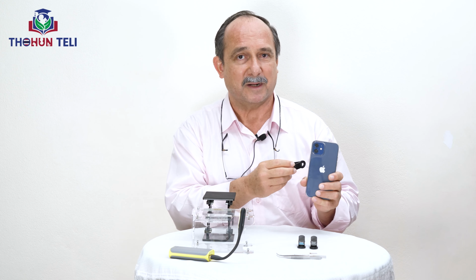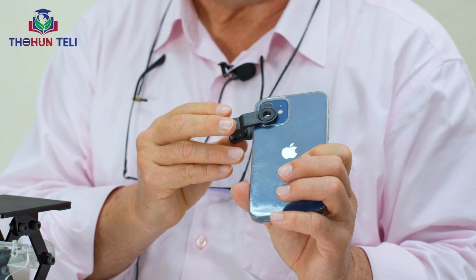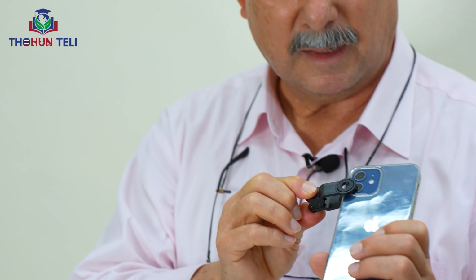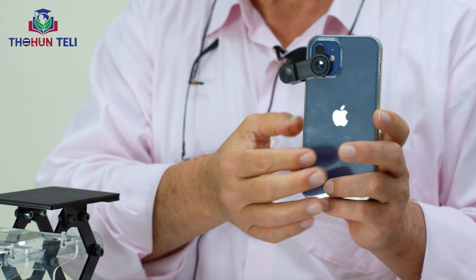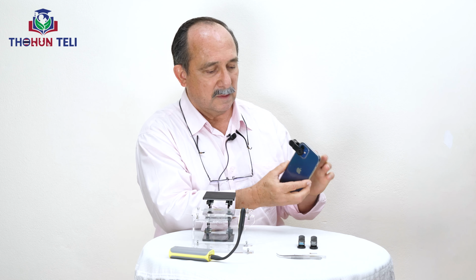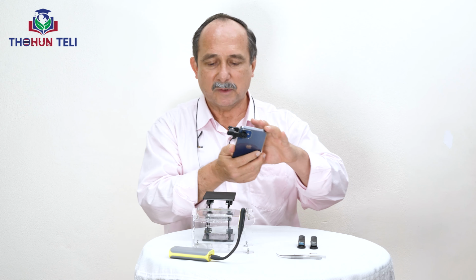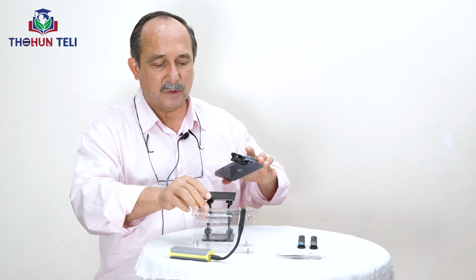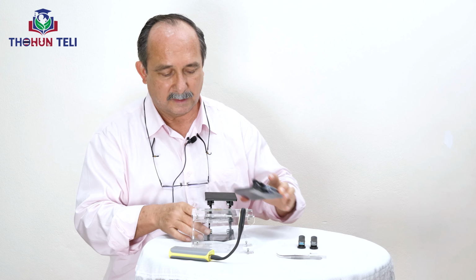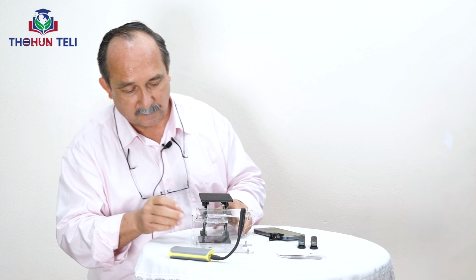How do we set this lens onto the telephone? We have to choose, because now the new telephones have several cameras. This one has only 2 cameras, so we just put the lens that we want to magnify over the telephone camera lens, okay? Just like this. So we turn on our telephone. We have the sample already on this platform, and also we have this platform, as I said, just to focus the sample.